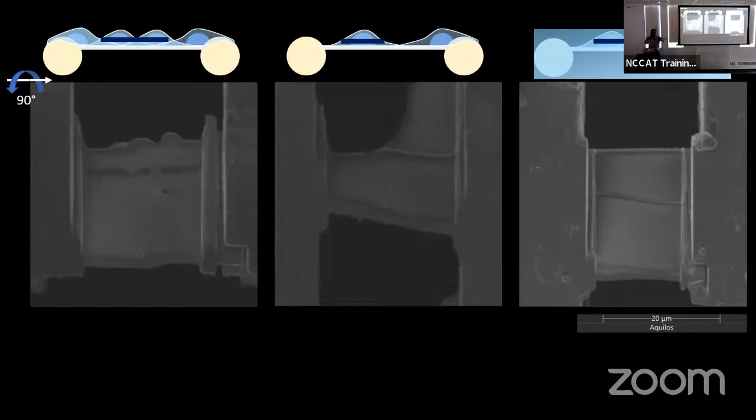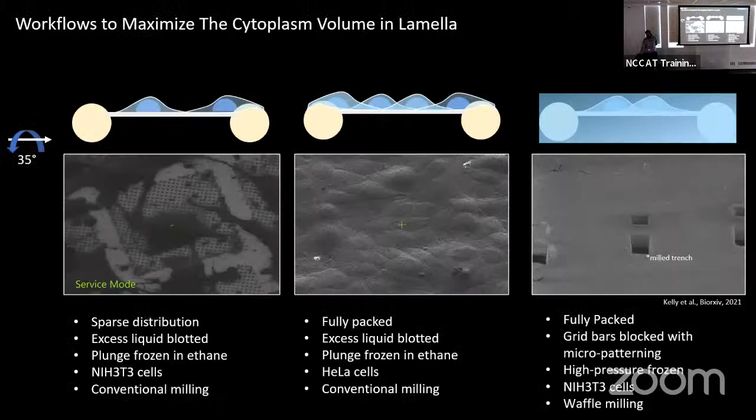So, if it doesn't mess up how the freezing goes and how the surface looks at the end, why not? So ideally you want, I'm sure Deja's brought this up, but ideally you want, where's the mouse? There you go. Ideally you want a flat surface like this. So anything that prevents that is not a good approach.